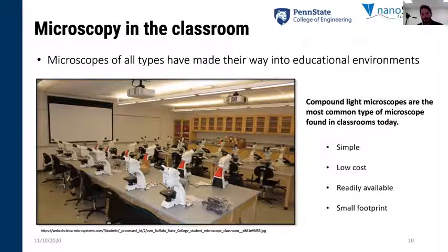This is one of the reasons why this type of microscope has become so ubiquitous in the classroom. However, there are a lot of other types of microscopes out there, and many of them could benefit the student as well. We're going to talk about one of those today, that being the scanning electron microscope.